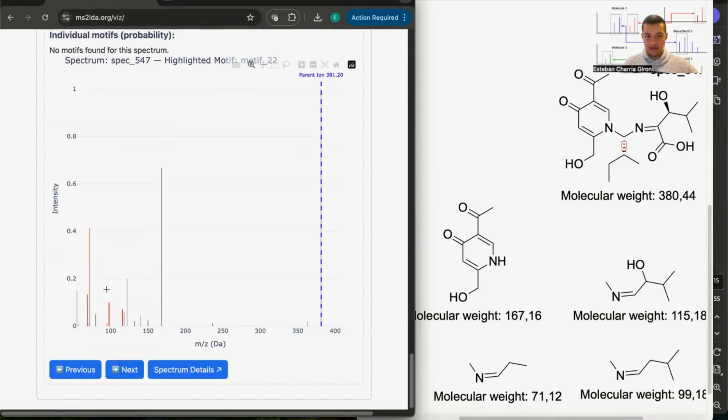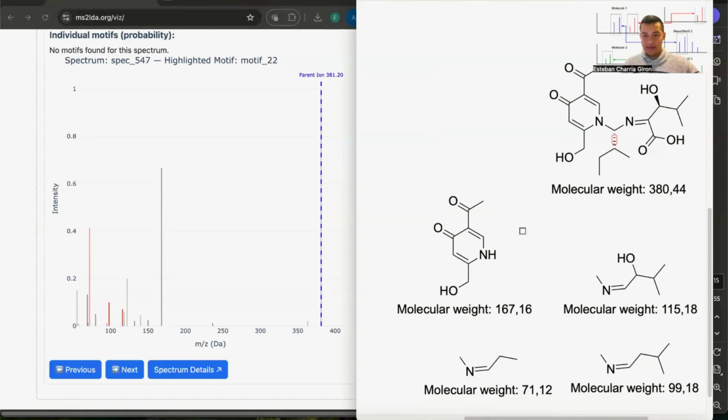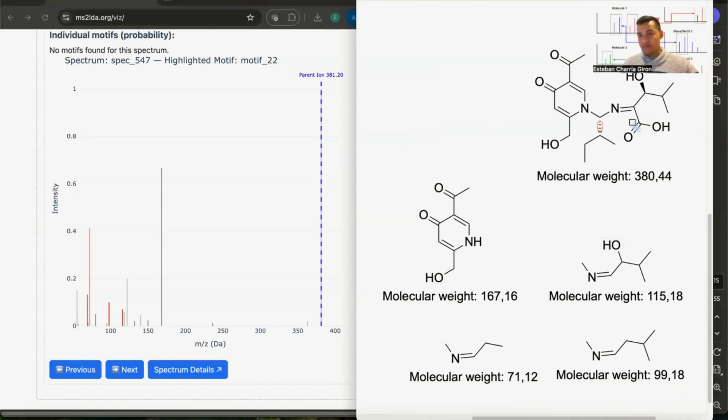We can see those fragments highlighted in the spectrum from erinaceriin N. So here I tried as well to do some similar analysis and try to match some of the substructures that are present in erinaceriin N to the masses of the fragments that we see.